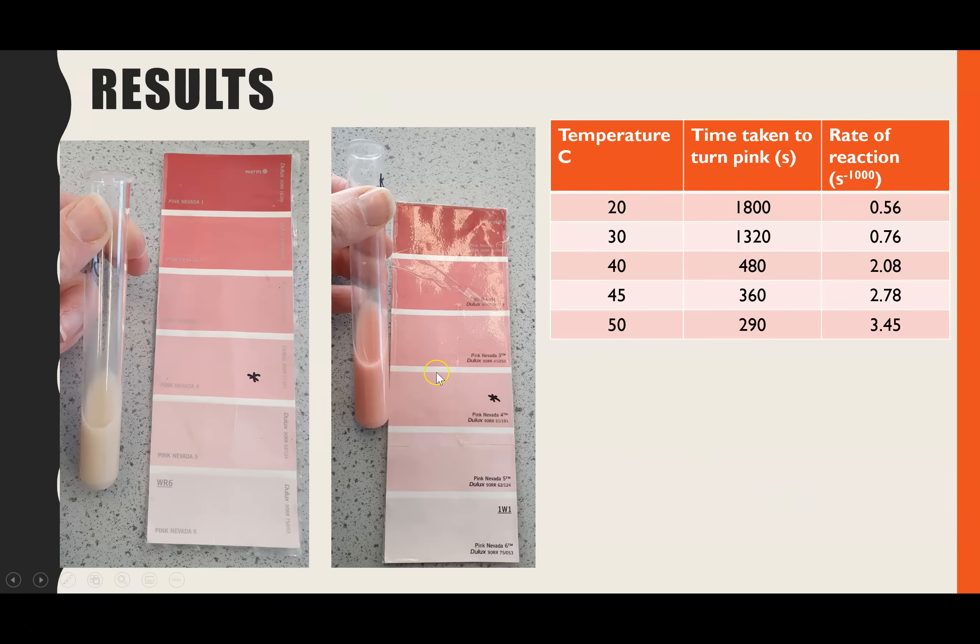The final endpoint, we can see compared to the start color and the end, this is how pink it did go eventually. It would go more pink than that, but I stopped it when it got to pink Nevada 4. That's the color that I was using on that pink paint chart. So that's our endpoint. When the reaction gets to the point that the solution is always that color, that's standardized our method.